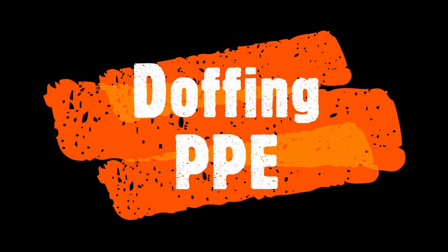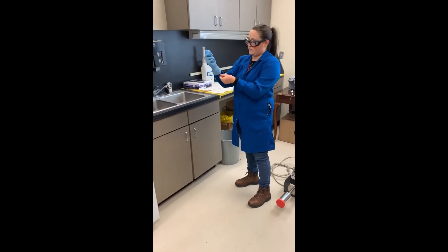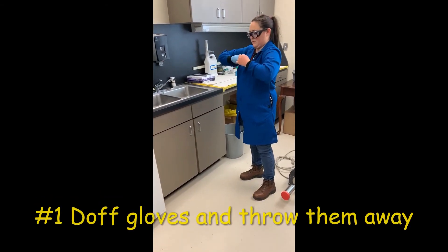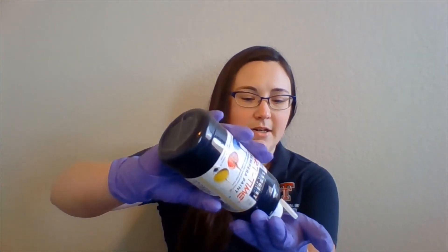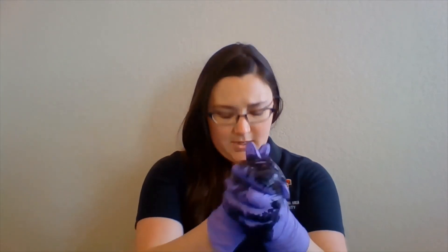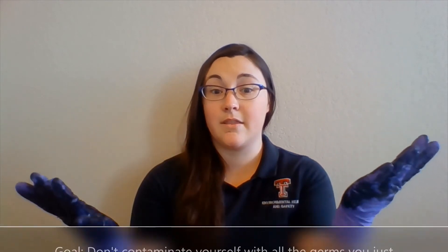Now let's talk about doffing — or taking off — PPE. It's the exact reversal of donning. First, remove your gloves. Let's watch that again in more detail. I have my gloves on. I'm going to use some paint here to mock some contamination on my gloves.